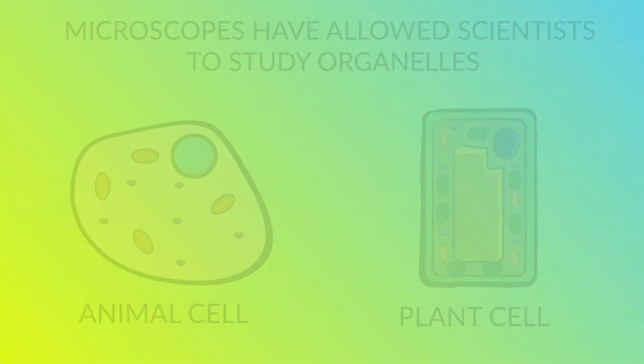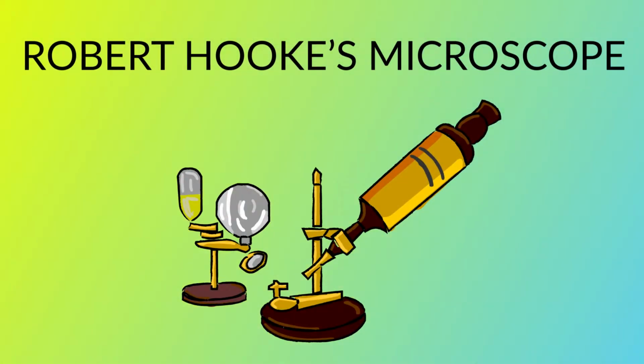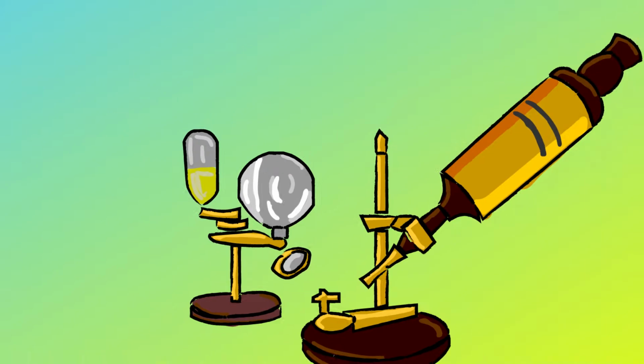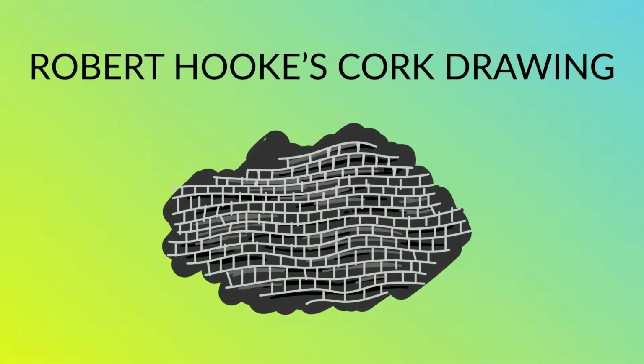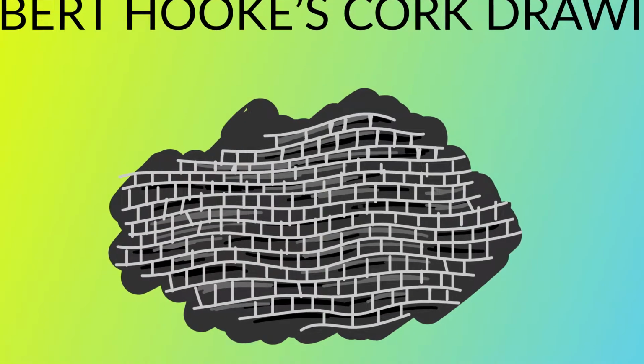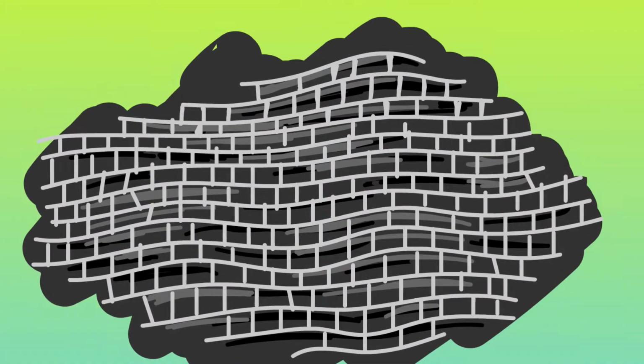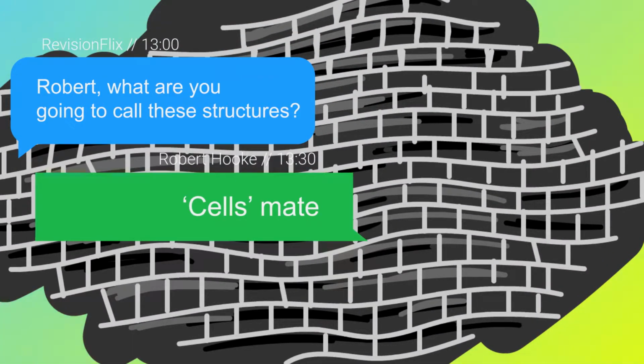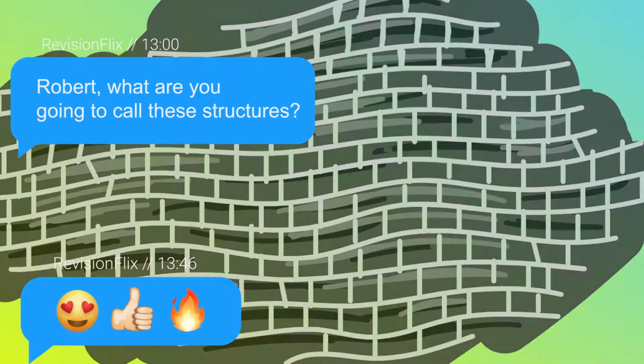This one here was used by a scientist called Robert Hooke back in 1665, where it uses light from an oil lamp to help see the specimen. Hooke looked at some cork and drew a picture of what he discovered. Hooke noted the small holes within the cork looked like tiny room-like structures, eventually coining the term cells.